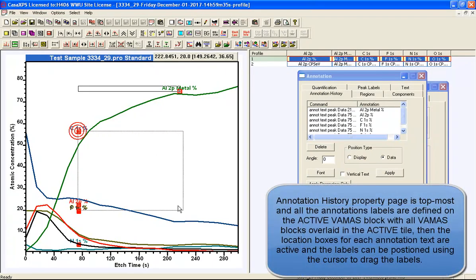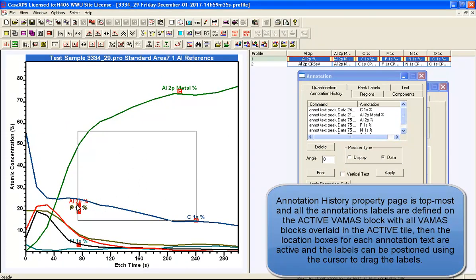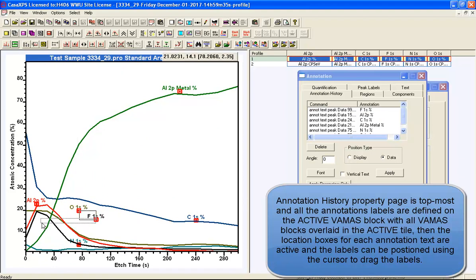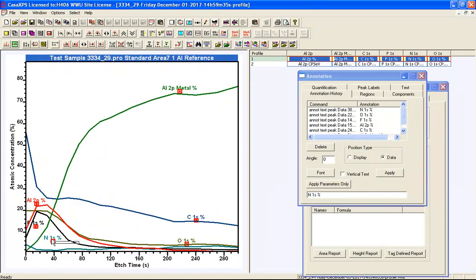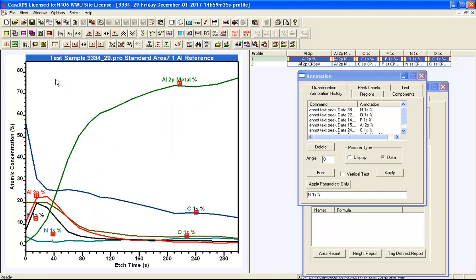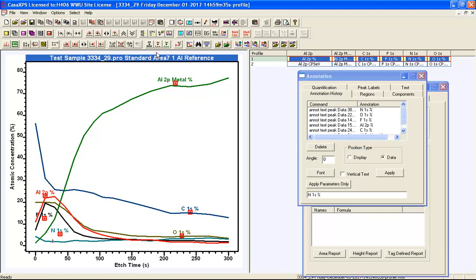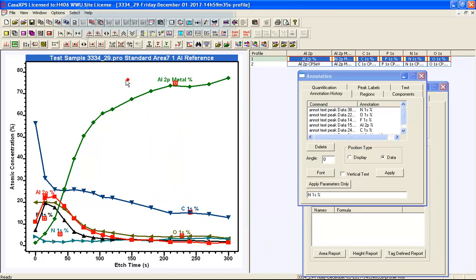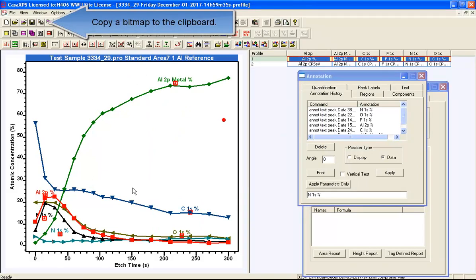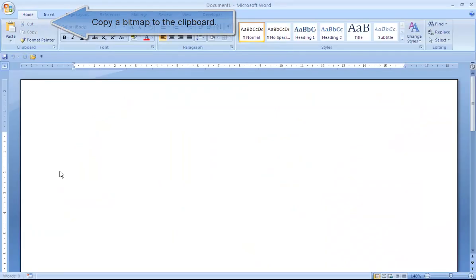With all labels on the active tile, you can move them around and adjust their positions — for example, repositioning the fluorine and nitrogen labels so they are better placed relative to the data. You can then step up, move labels out of the way, add shapes if needed, take a copy, and paste into a document such as Word.